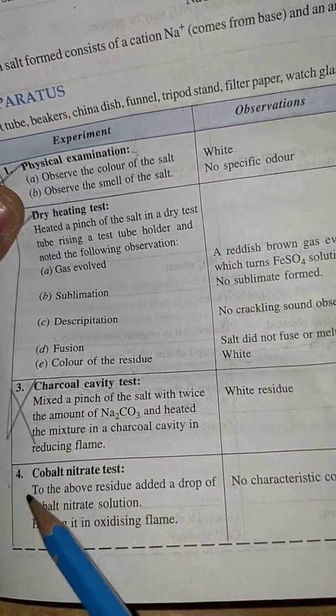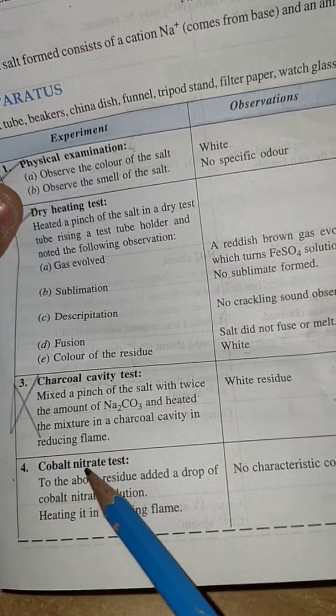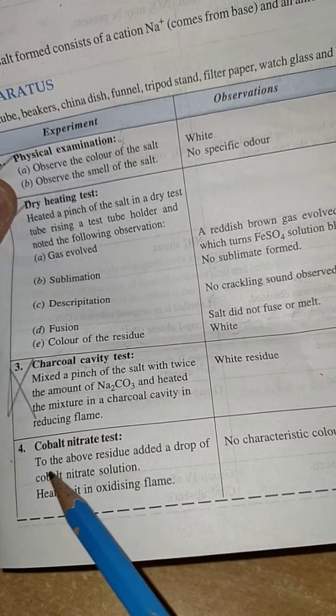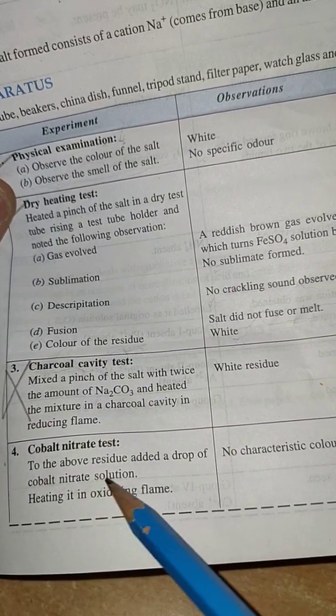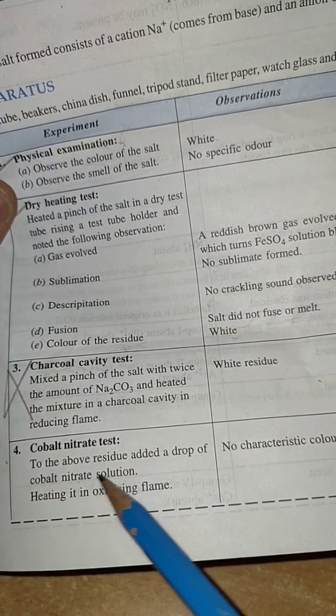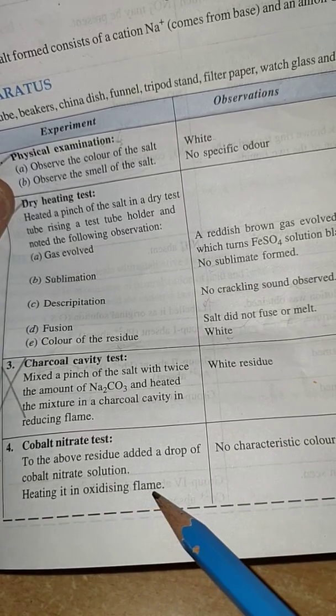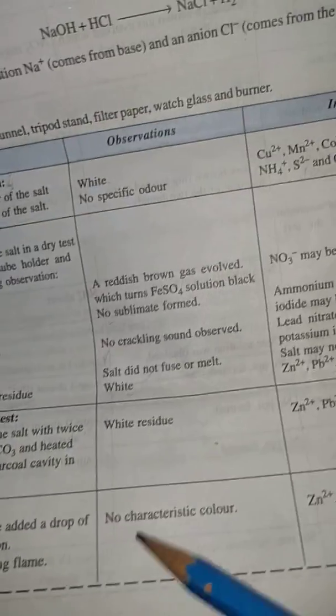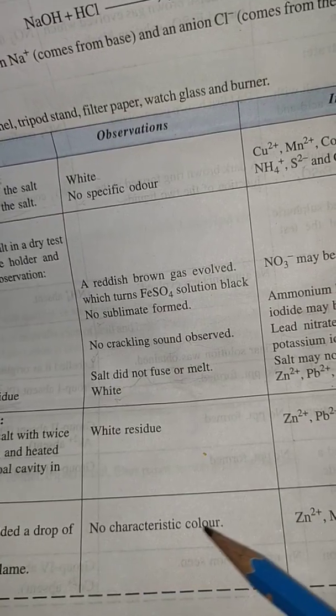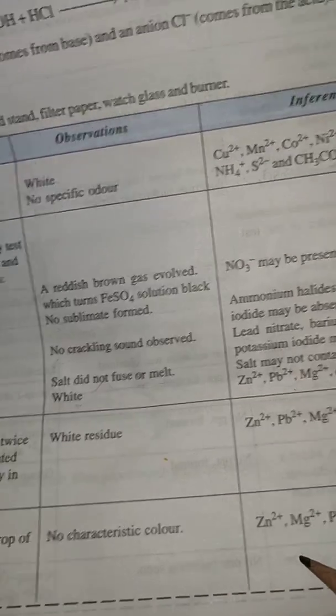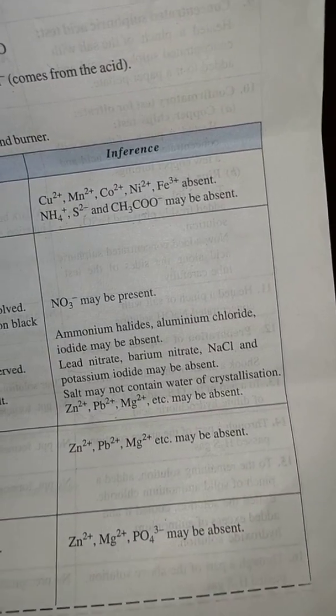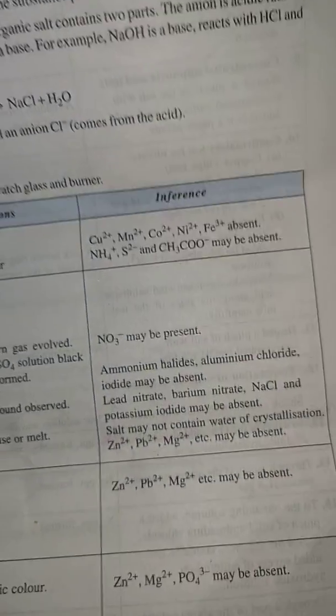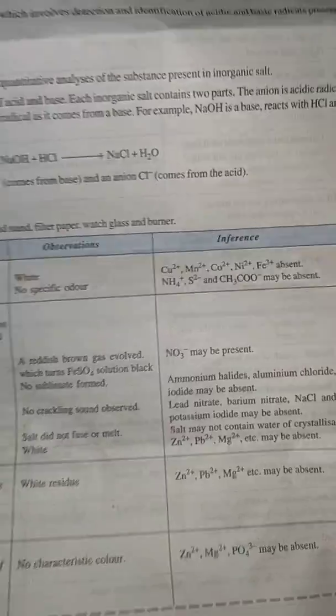Now come to the cobalt nitrate test: to the above residue add a drop of cobalt nitrate solution and heat it in oxidizing flame. No characteristic color, so zinc, magnesium, or PO4³⁻ may be absent.